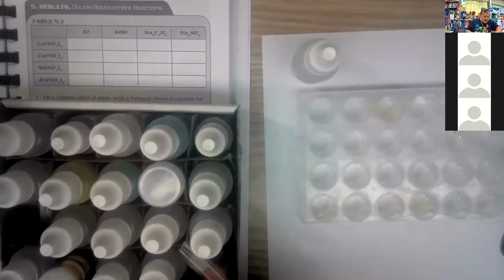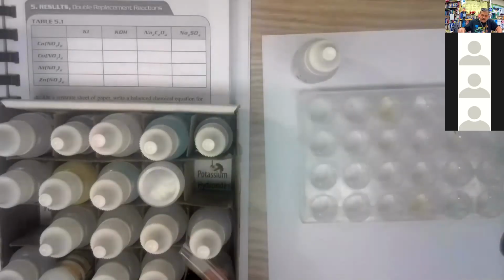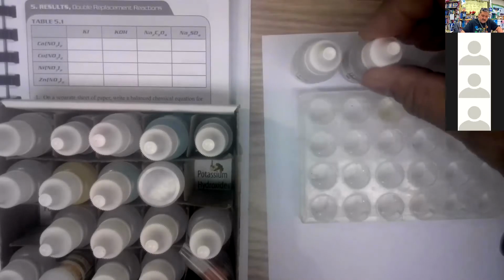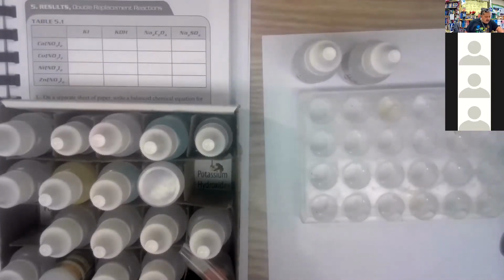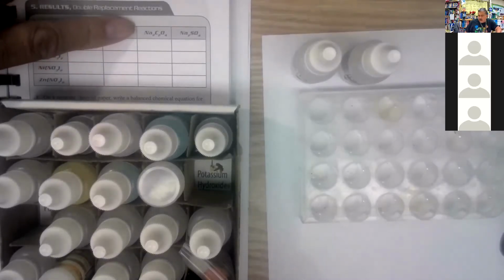Okay, and then we got sodium hydroxide. Let's see, where's that in your box? Oh, it's not sodium hydroxide, it's potassium hydroxide, which is right here. Obviously K, potassium. Okay. There's the sodium oxalate, which is this one right here.